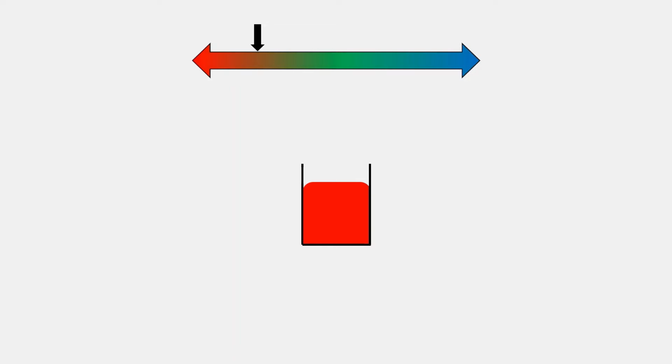We can measure out a known quantity of sodium bicarbonate and add it to the acid until the solution is neutral, and that can be seen as the droplets here. So it's gone neutral because it's gone green.